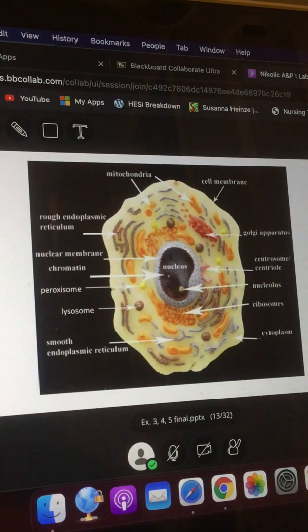So the nucleolus are here, and I've got this little ball here, right? Depending on what source you look at, there's like 1 or 2 nucleolus, right? We often just say that there's more than one nucleolus, nucleoli. You can see it's just the ball in the middle. Okay, now this is labeled as well, so that's great.